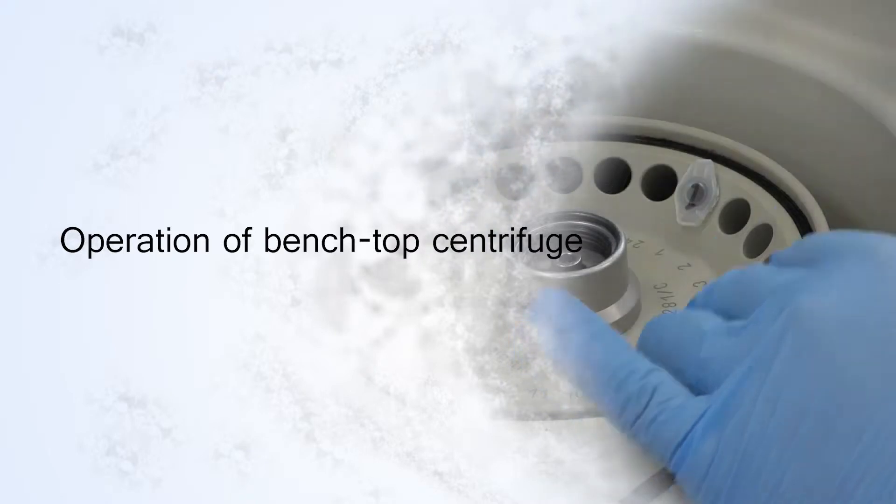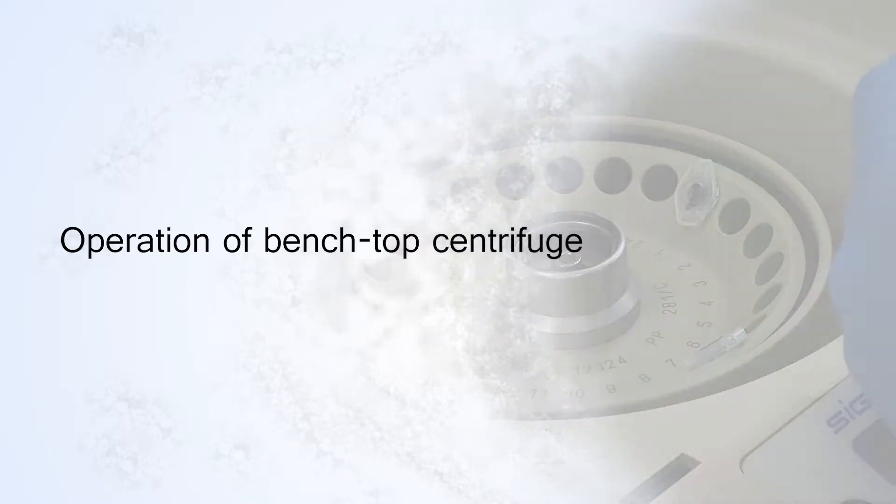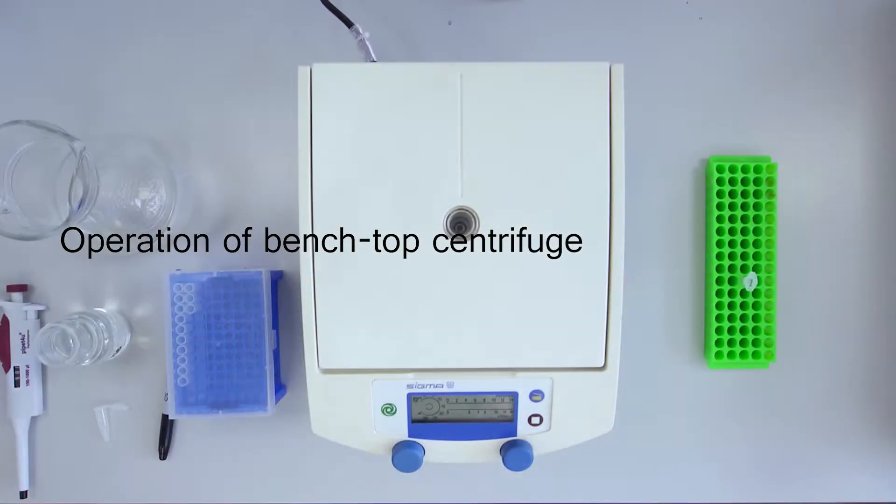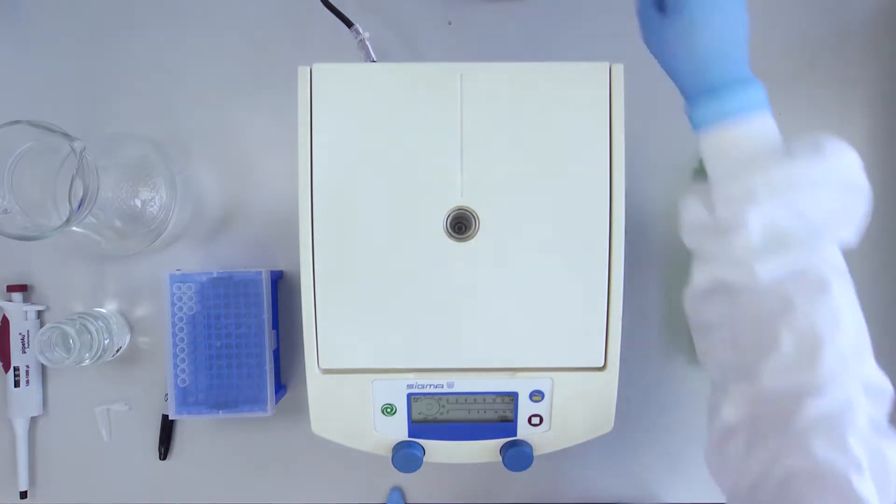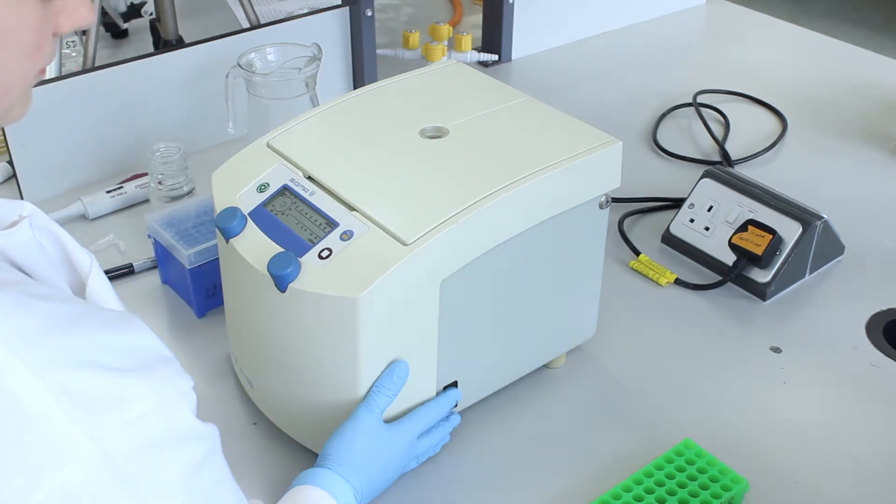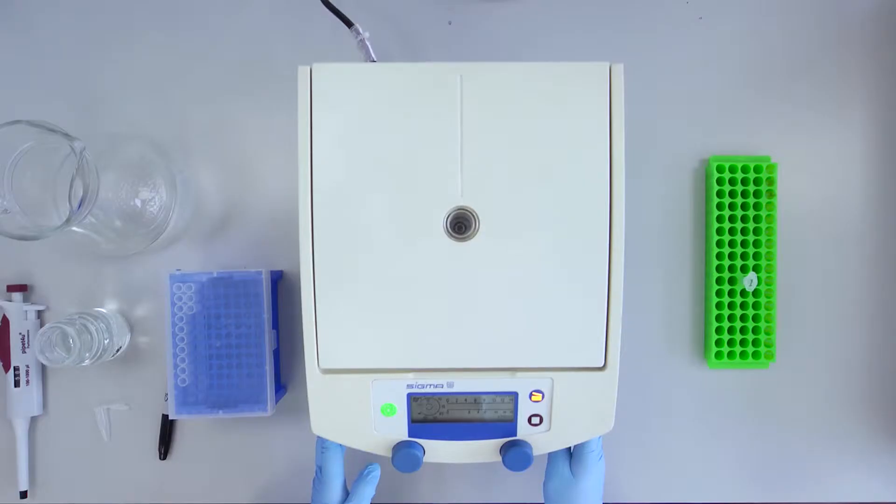To operate the Sigma Benchtop Centrifuge, make sure it is on a level surface and turn on the power at the socket and switch the centrifuge on at the switch on the side.